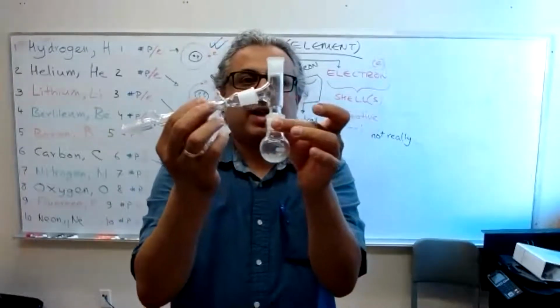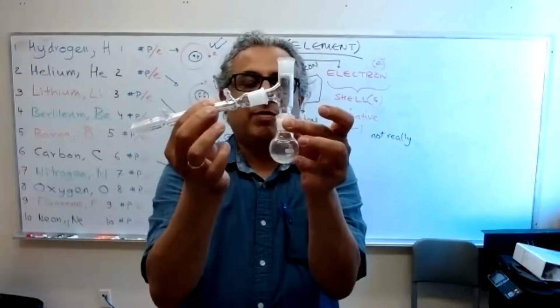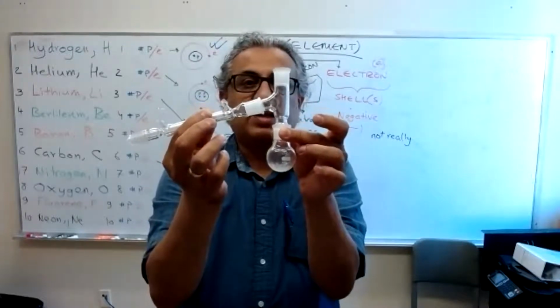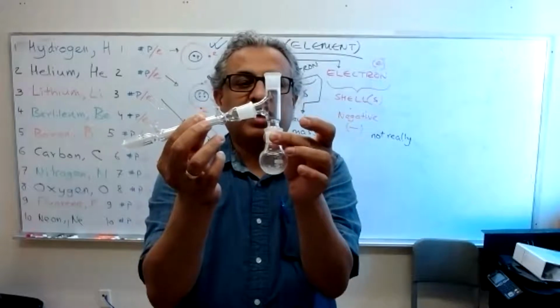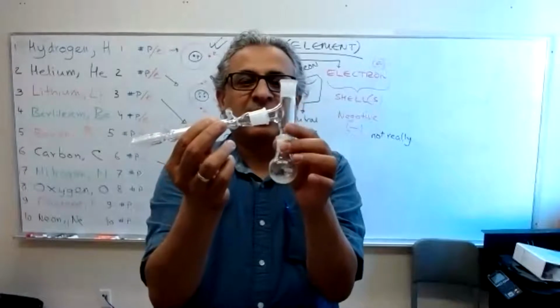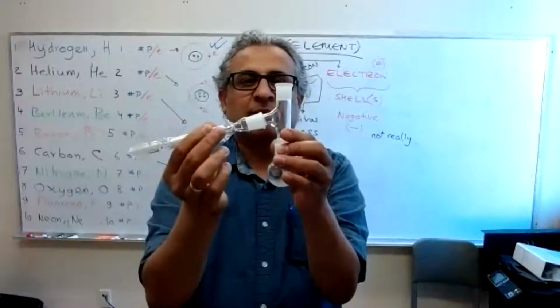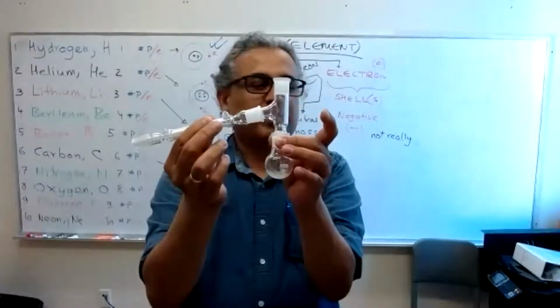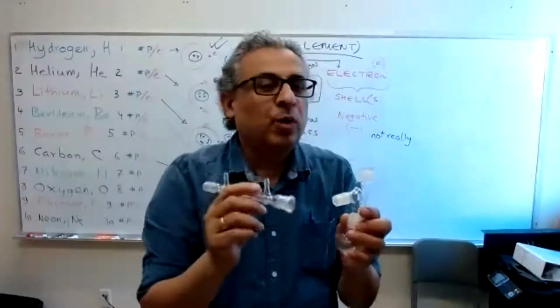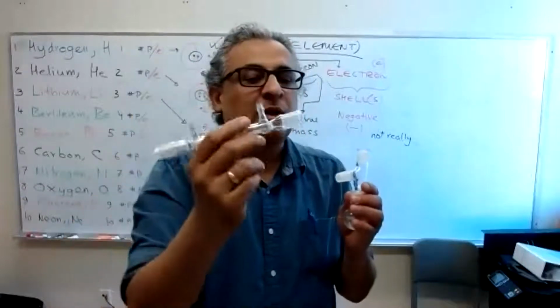There are 3 glasswares in this setup. One is a round bottom flask, one is a condenser, and the third thing is not a condenser, something else. What's that? Which one is the condenser? This one or this one? Is the condenser the one on top of the RB? Oh. What's this? Which one do you think is going to convert the gas into a liquid?